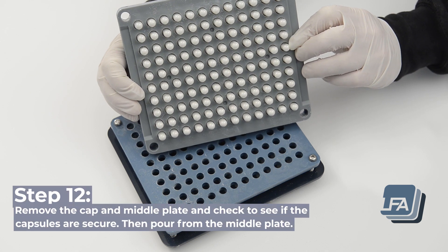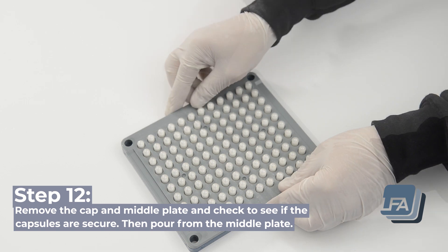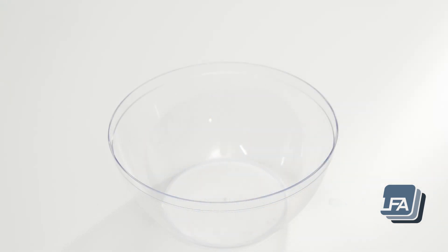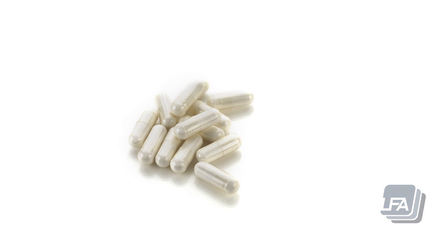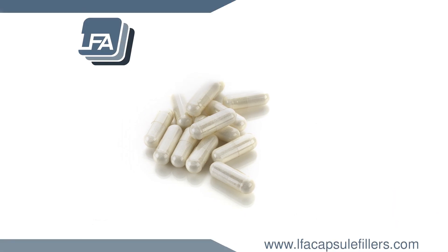Step 12: remove the cap and middle plate to check if the capsules are secure, then pour from the middle plate. For more information on the ProCap Capsule Filler, please visit www.lfacapsulefillers.com.